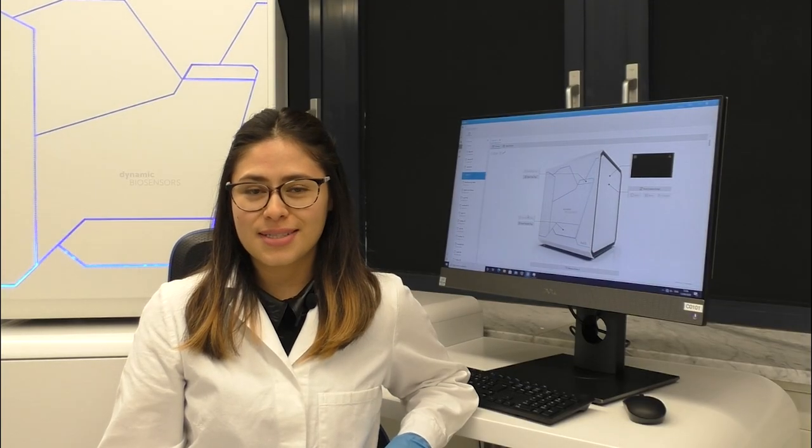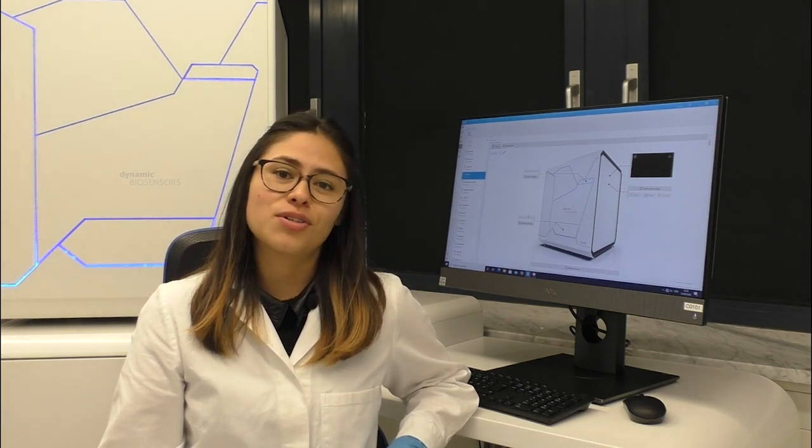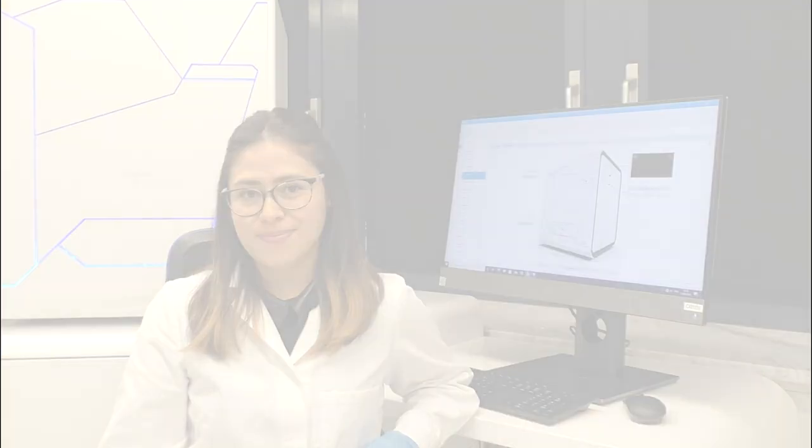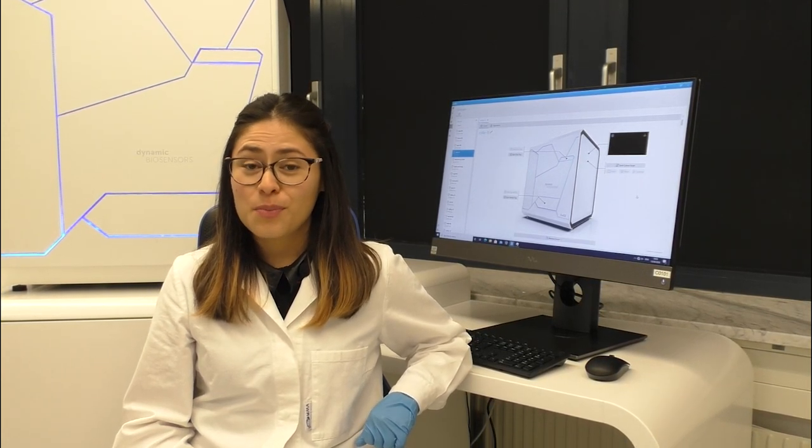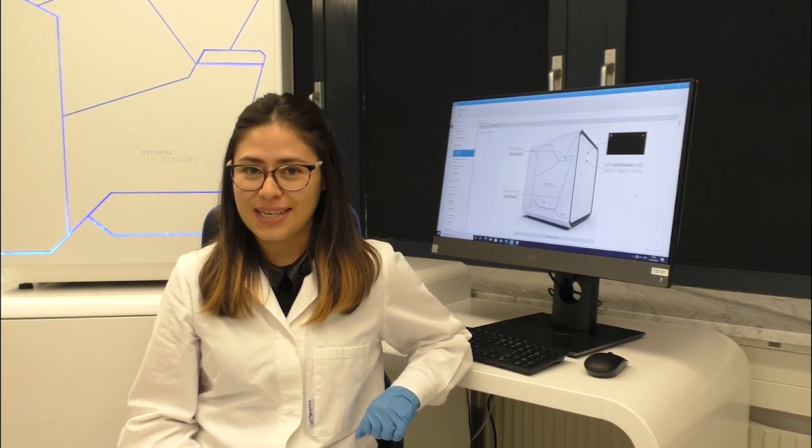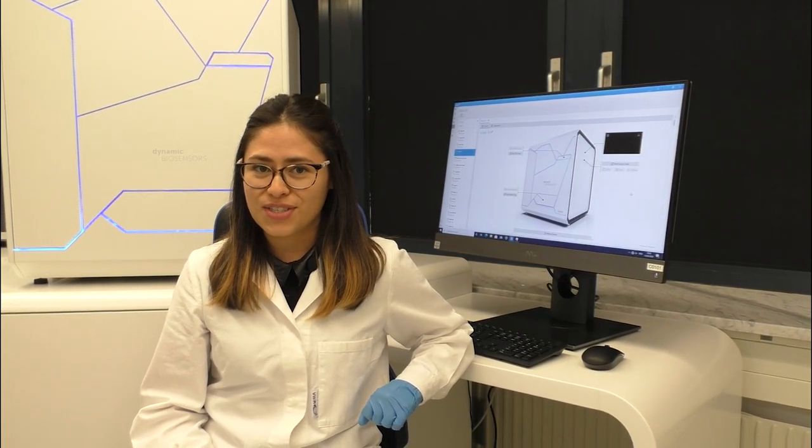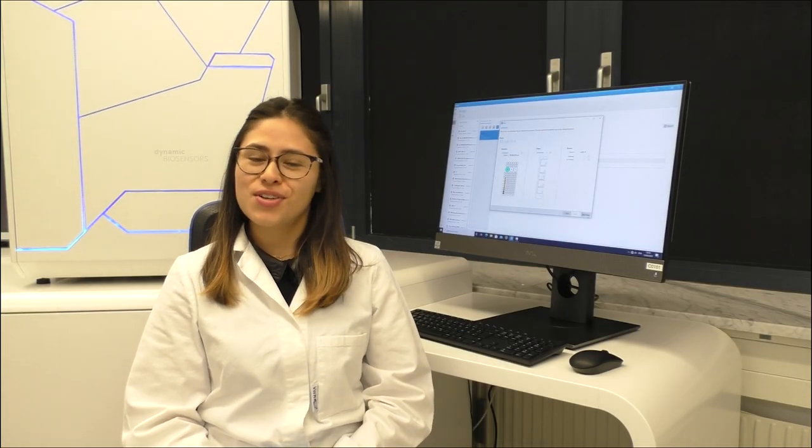The Helios software includes a step-by-step guide to plan and set up experimental workflows. But assays can also be predefined and saved in Helios, which allows you to start an experiment with only a few clicks. We are going to take advantage of one of these predefined assays right now, but more details on how to plan experiments with the Helios software are explained in another tutorial which you can find on the Learning Center at the Dynamic Biosensors homepage. Here is the auto-sampler view which shows the ligand in blue and the five analyte concentrations in orange. In purple, you can see two other liquids. We will discuss in a bit what they are used for. But for now, we are all set to measure, so let's press start.